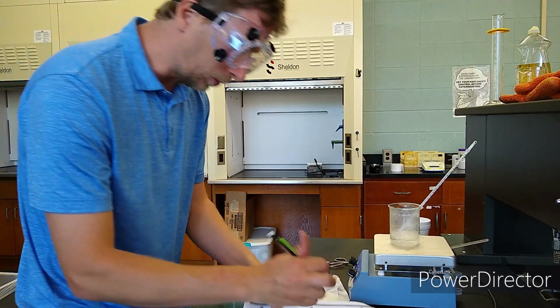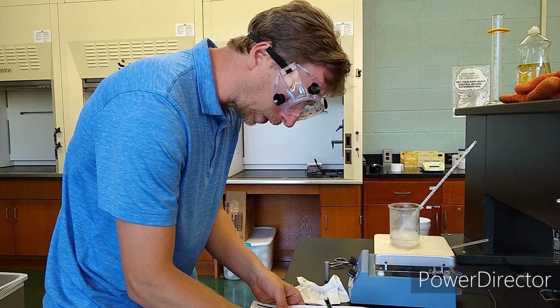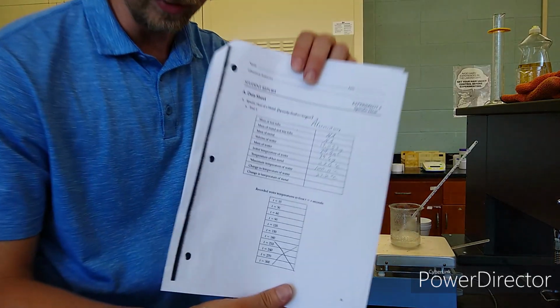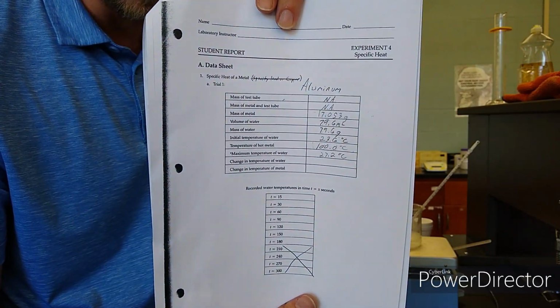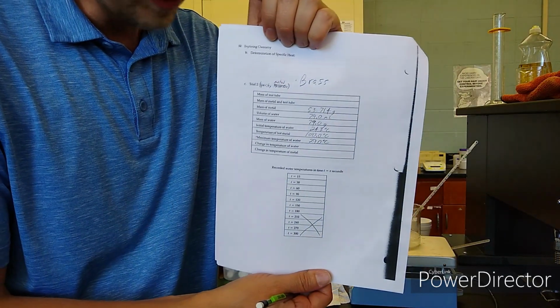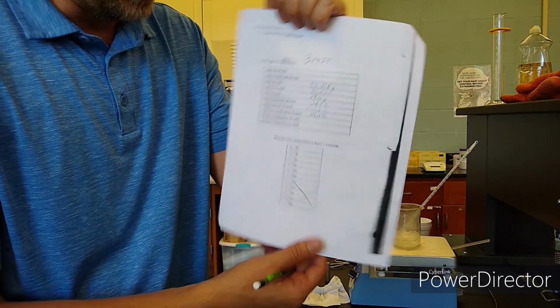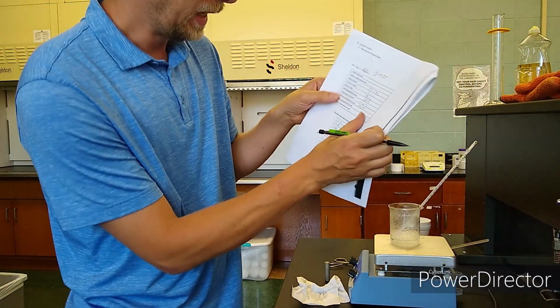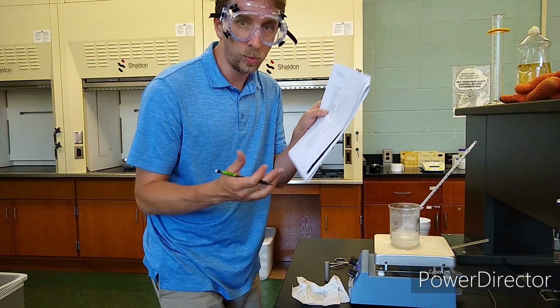And then the first one that we did was aluminum. All right, so writing that down. So here is the aluminum data that we got at first. Okay, and here is the data for the brass. All right, now what you need is the change in temperature of water. That would be inside the calorimeter. That is what we are interested in.